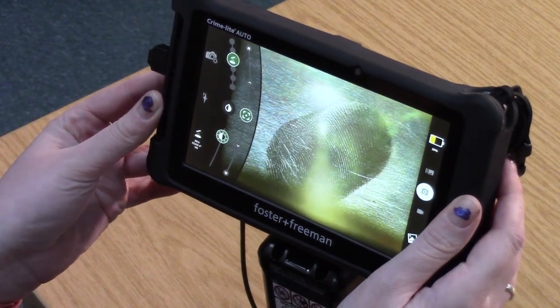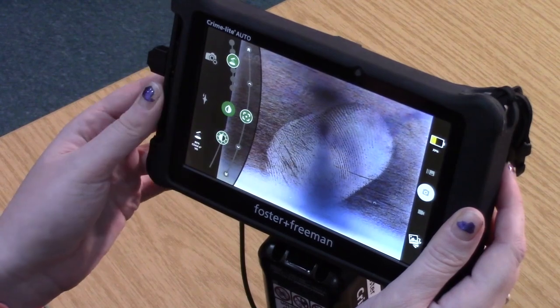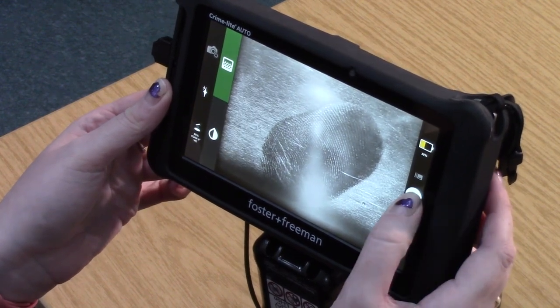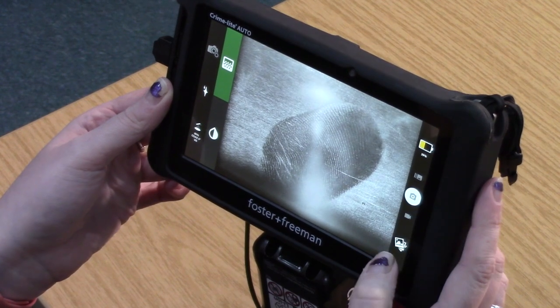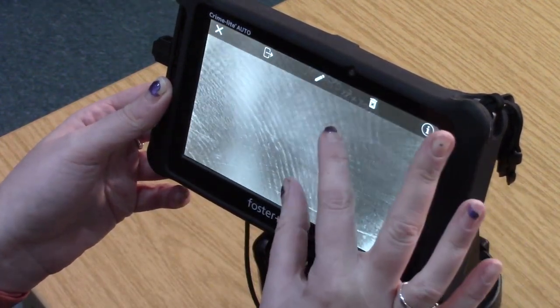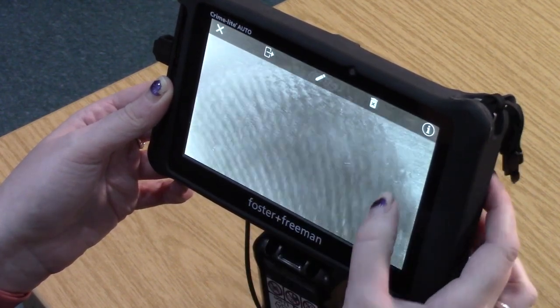We can also change the angle of the mirror, which sometimes can help us to bring more of the finger mark into focus. As you can see now, we're actually getting a really clear, nice finger mark by changing the angle of the mirror. We can also invert and grayscale where needed. If we now capture an image, there is our latent finger mark. And if we zoom in, we can see lots of clear, flowing ridge detail from the finger mark.